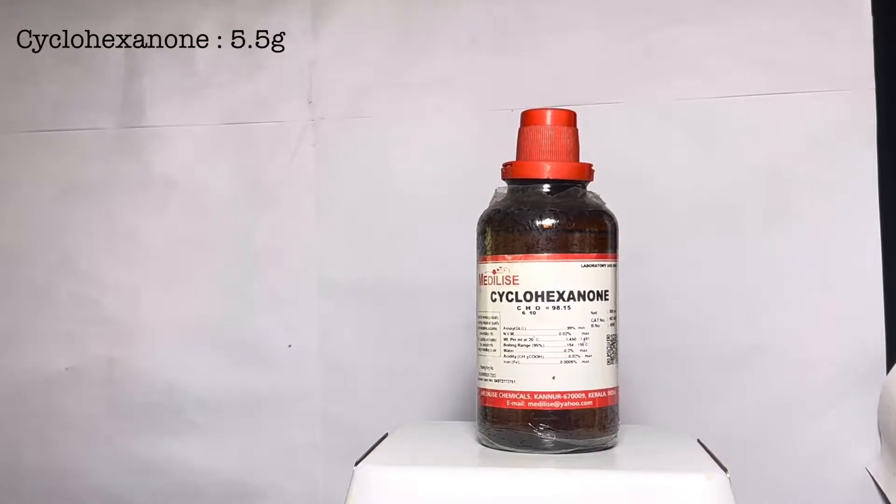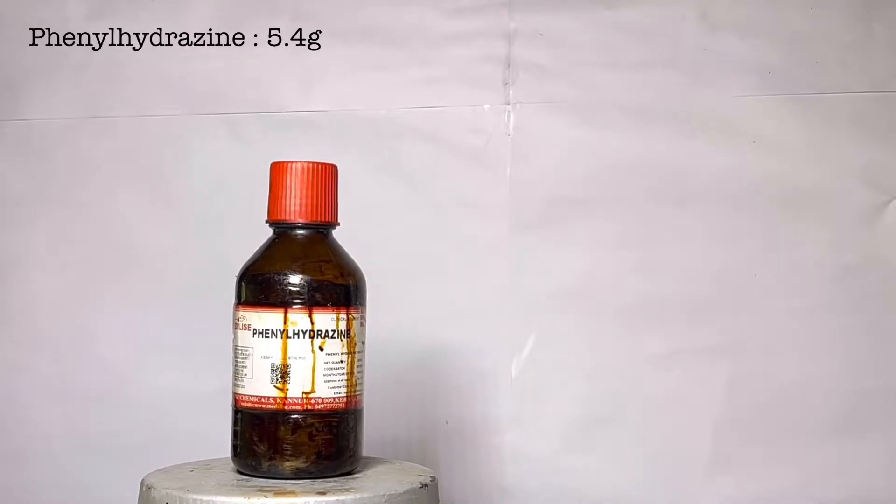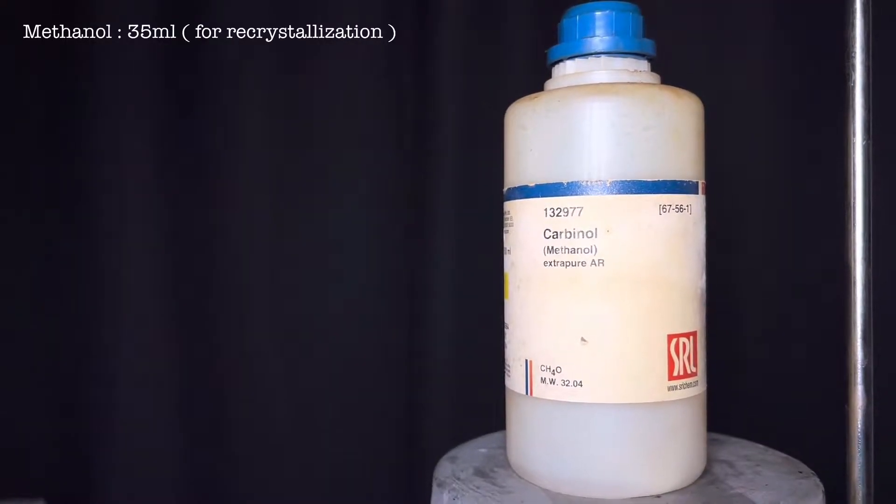For this experiment you will need 5.5 grams of cyclohexanone, 18 grams of glacial acetic acid, 5.4 grams of phenylhydrazine, and 35 ml of methanol for recrystallization.